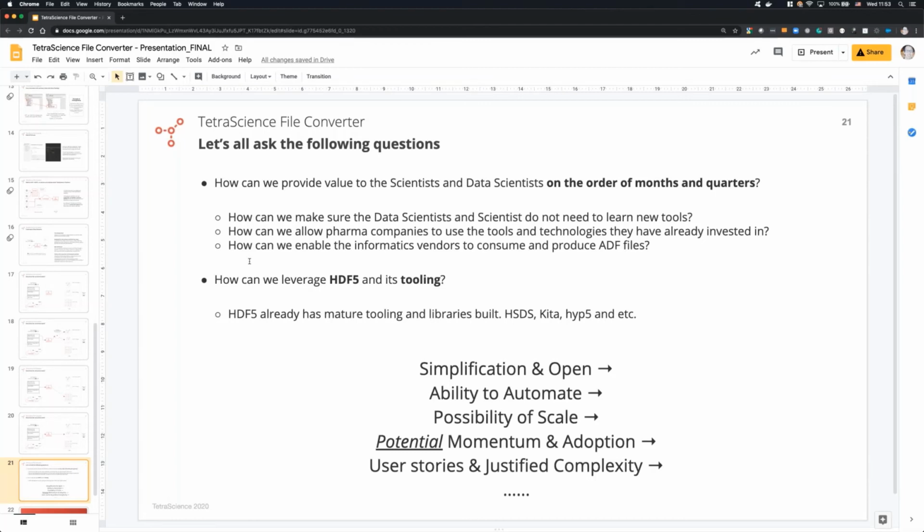Okay, so John, can you talk about your first point? Can you clarify that? Unlike a commercial vendor's software, we don't normally have any tools to be able to access that data. It's in a hidden proprietary format, which we would have to reverse engineer to try and work out how to get to it. Allotrope is very different in that it's a published resource. So I don't think that's a true equivalence.